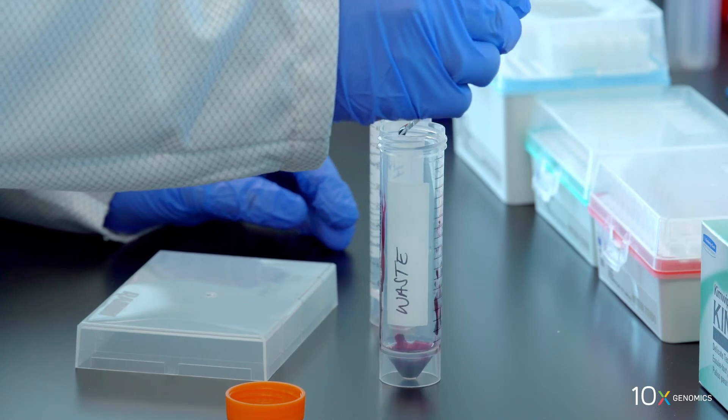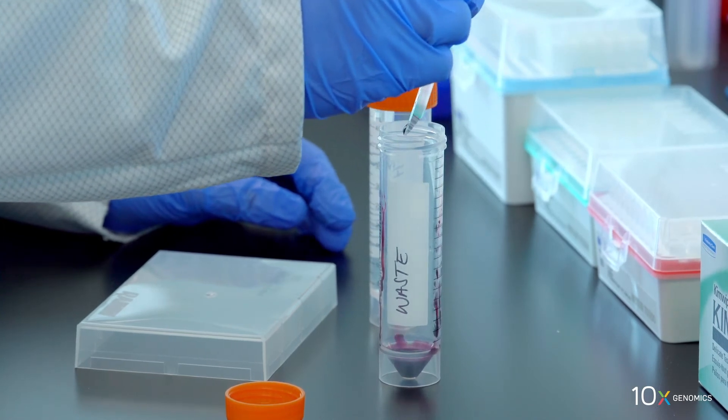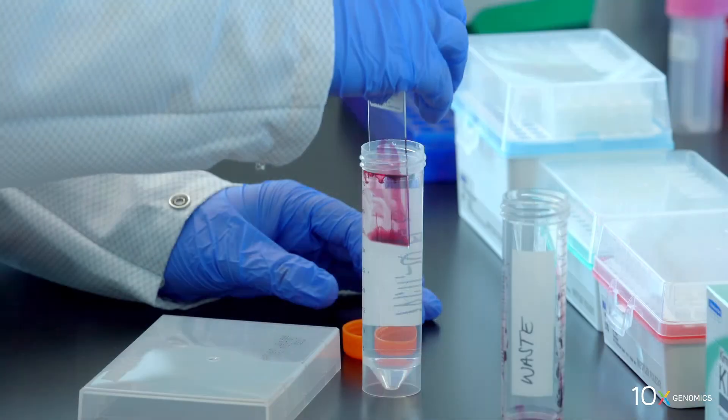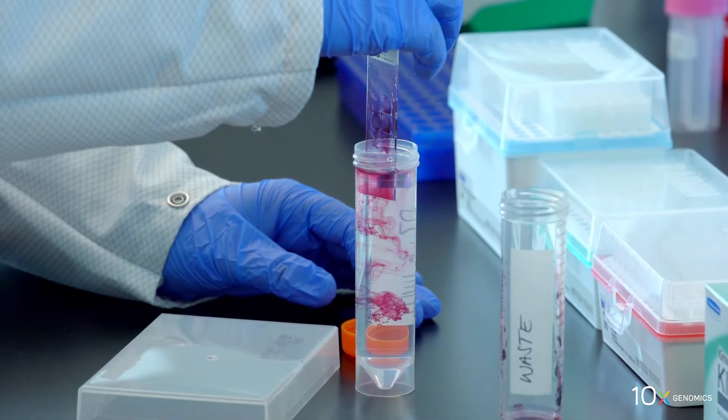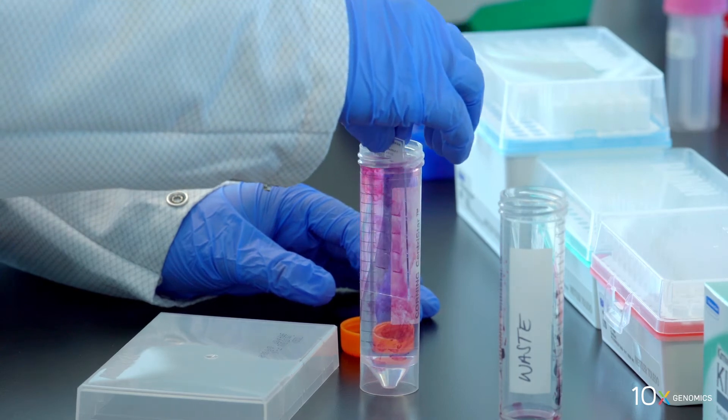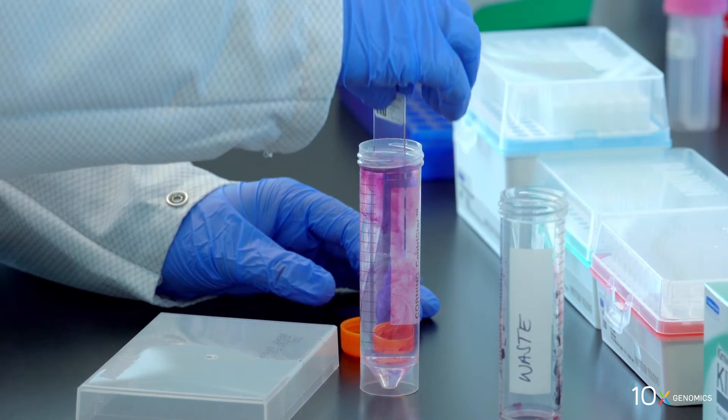Discard the reagents by draining and/or holding the slide at an angle with the bottom edge in contact with a laboratory wipe. Immerse the slide five times in the water in the centrifuge tube. When immersing slides in water, ensure that the slide is completely submerged.